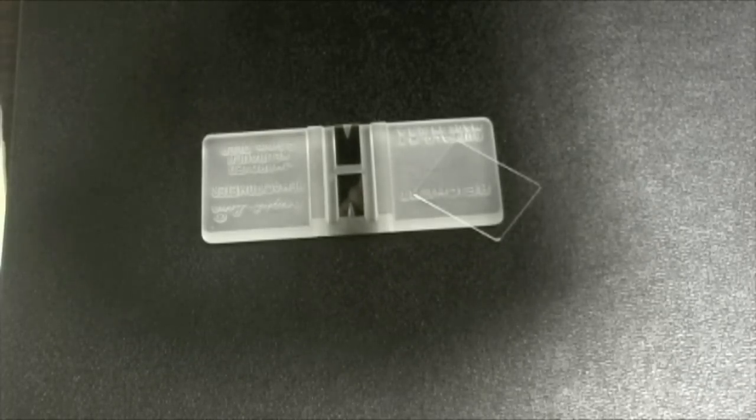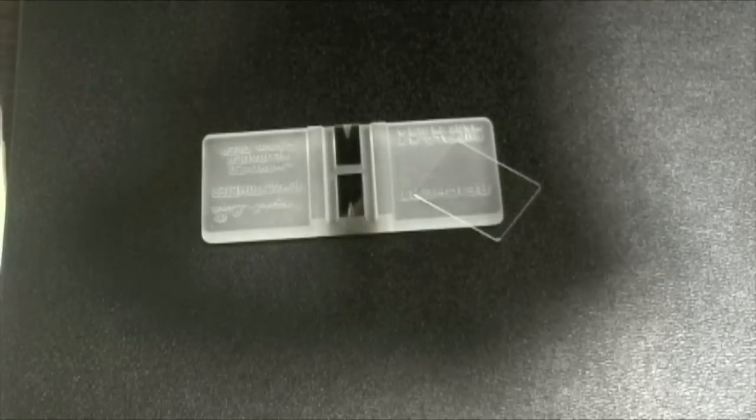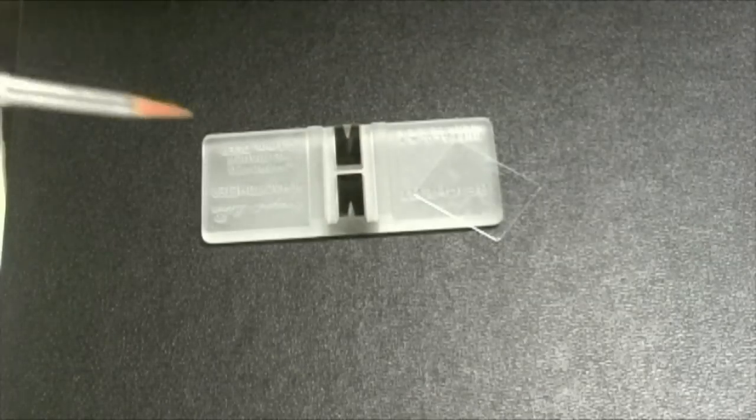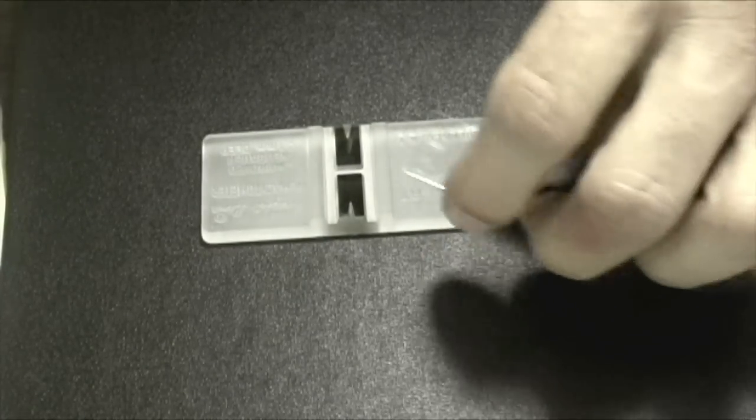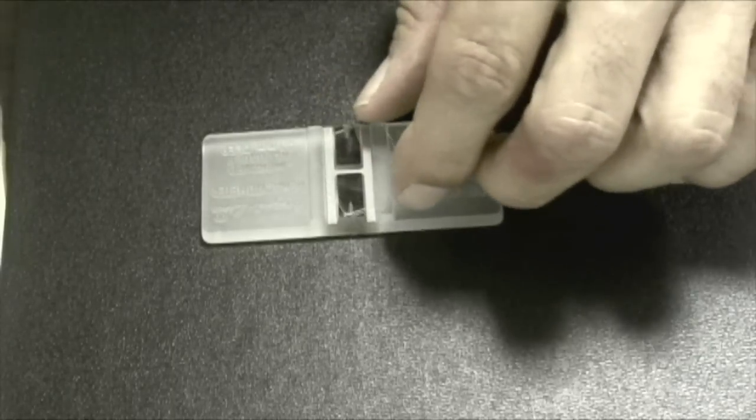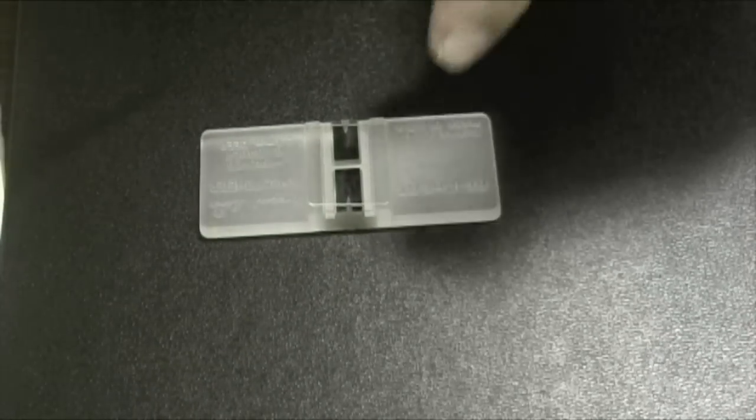Let me draw up a little bit of a sample. Typically, we're going to use a pipettor with a pipette tip, and as you can see there, it's nice and orange. You always want to put the cover slip on first. It's inappropriate to put a drop of liquid on there and then put the cover slip on. What the cover slip does is it forms a small chamber.